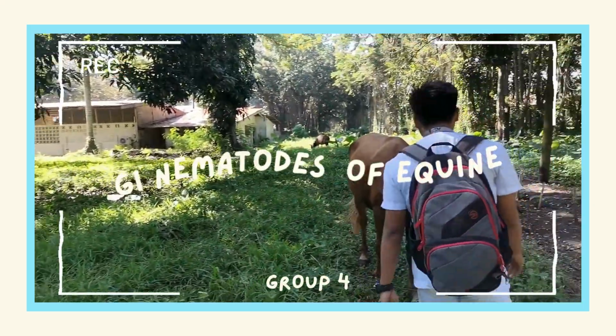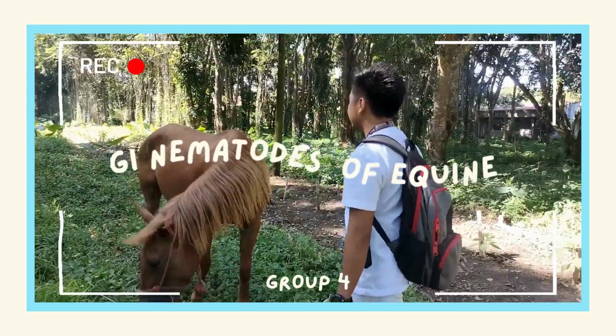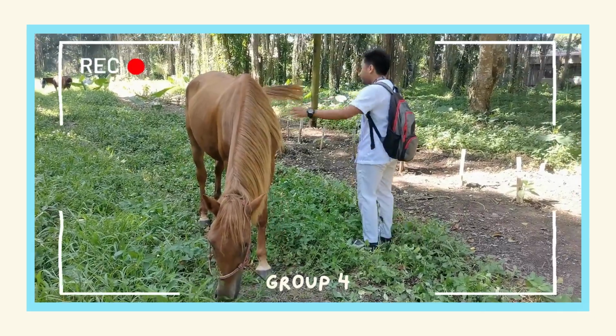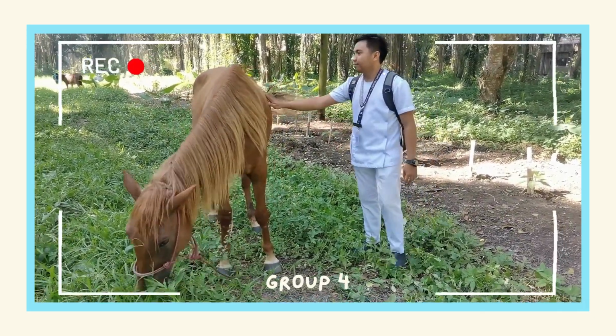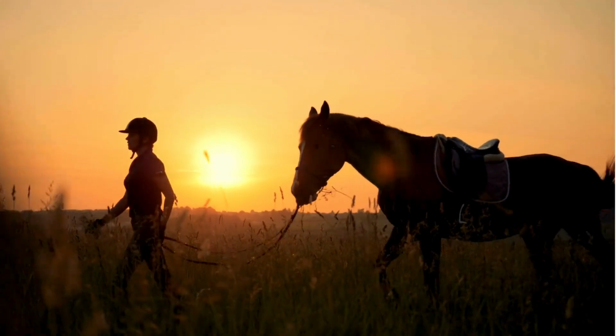Hello everyone! In this video, I will tell you what are the different gastrointestinal parasites that infect horses. I will also show the procedure for performing a flotation technique to identify the parasites present in the fecal sample.